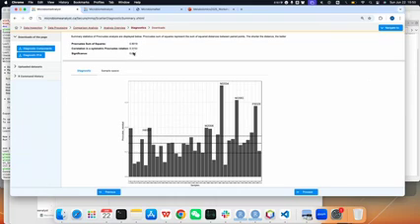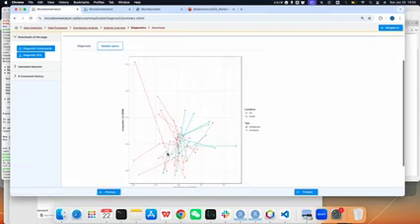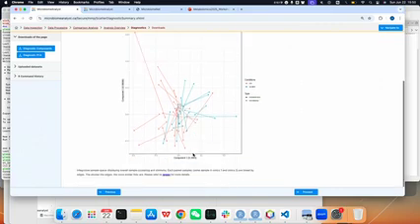Then we got a significant result, which means this result should not be random. It should have statistical power. Here we can see there are several, about 7 samples, where the data were not paired well. You can see here, in different groups, if the line is too long, it means the two data sets are not aligned well. So here is the summary.